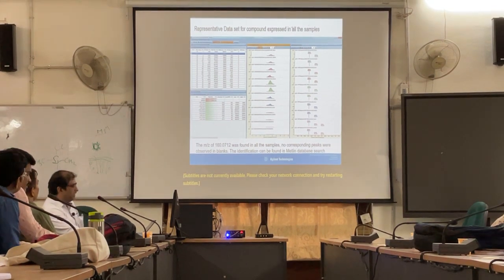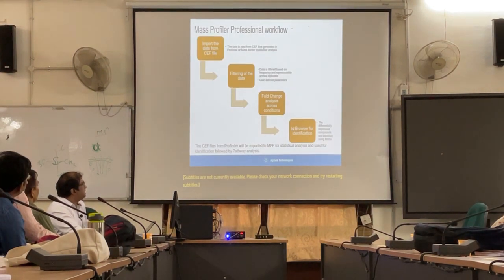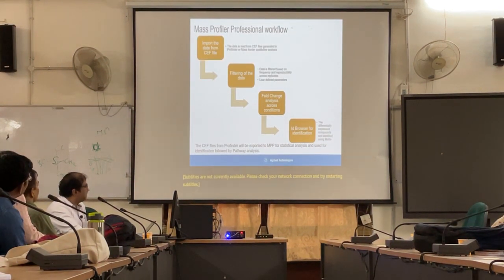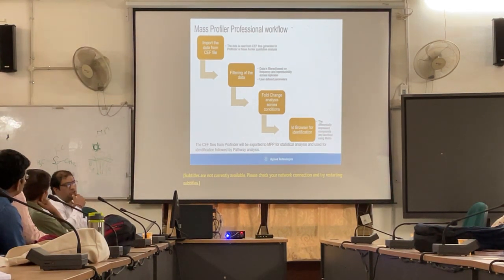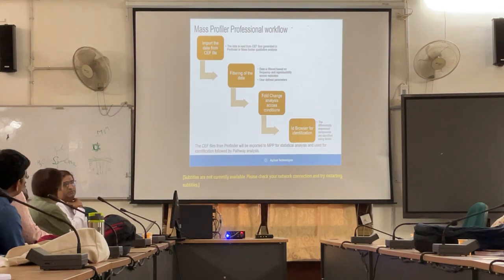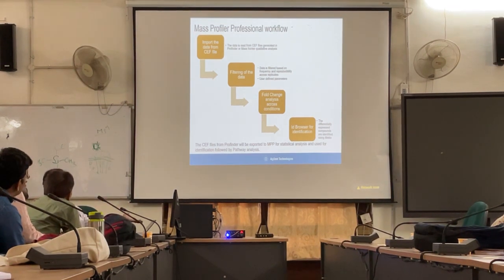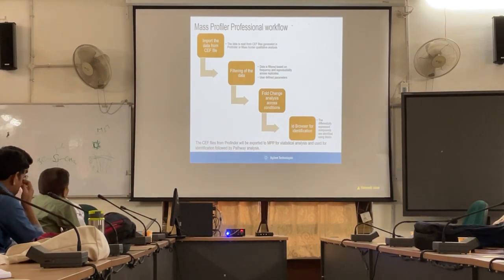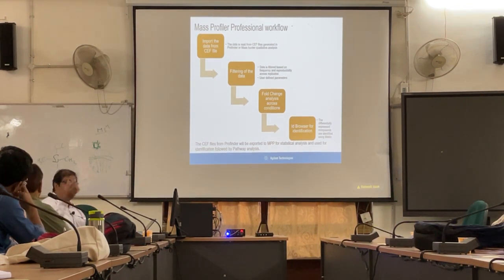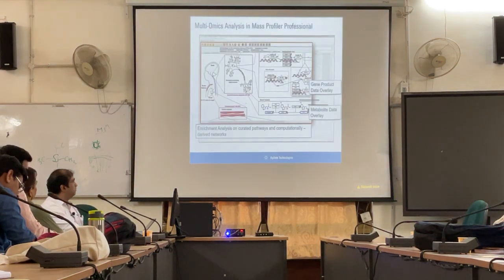So now you see the profiler data for most of the peaks which we are showing here. Okay? And then what we do is filtration of these peaks based on the fold change. Because you cannot do absolute quantification. Absolute quantification you need to have a standard. But if you have two samples, one sample having one abundance, another sample another abundance, you can do a relative quantification. And relative quantification is with fold change, right? I don't know what amount, but it should be more than 2 or 3 times, whatever you want. So that is the filtering we do.